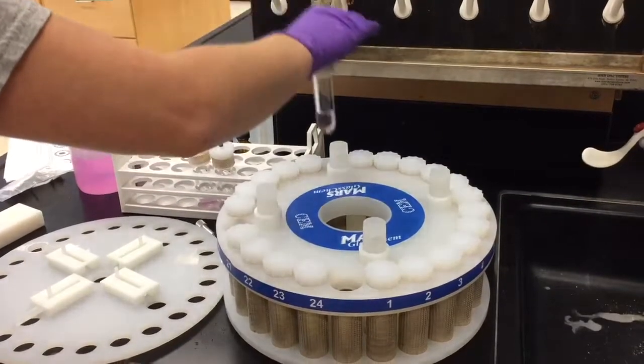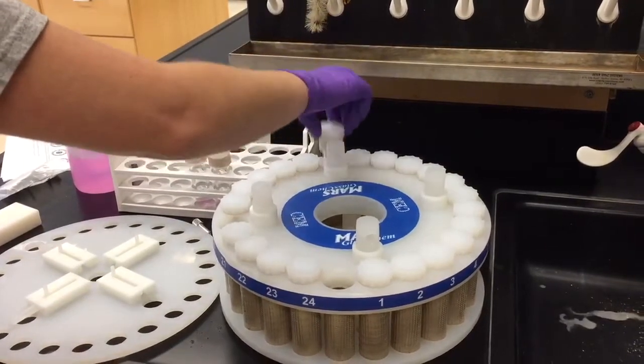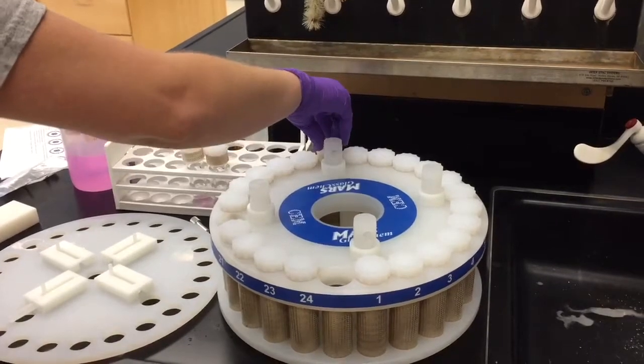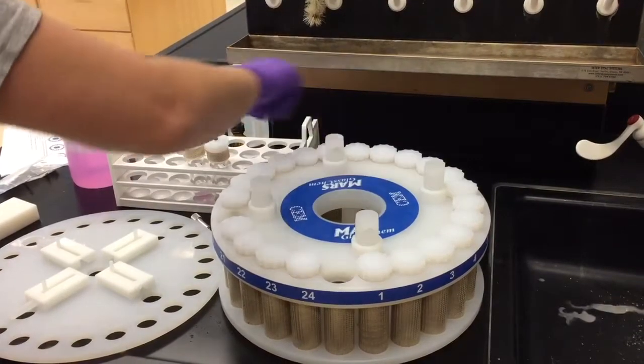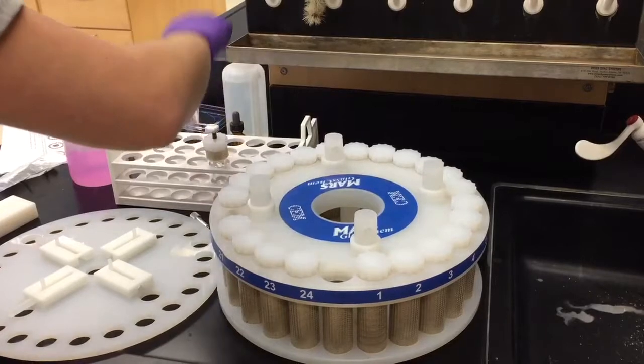For instance, if one vessel goes in number 1, the other must go on the opposite side in number 13. The remaining two vessels must go in number 7 and 19.